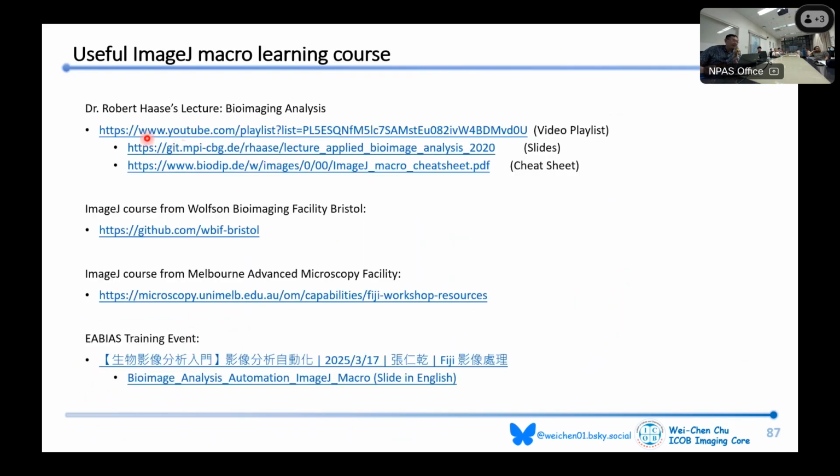There are many other great learning resources online. Dr. Robert Haas provides a very comprehensive bioimage analysis lecture online. This is his playlist, complete with slides and cheat sheet, so you can start from here. And if you want to learn more, you can also refer to other image analysis training material.